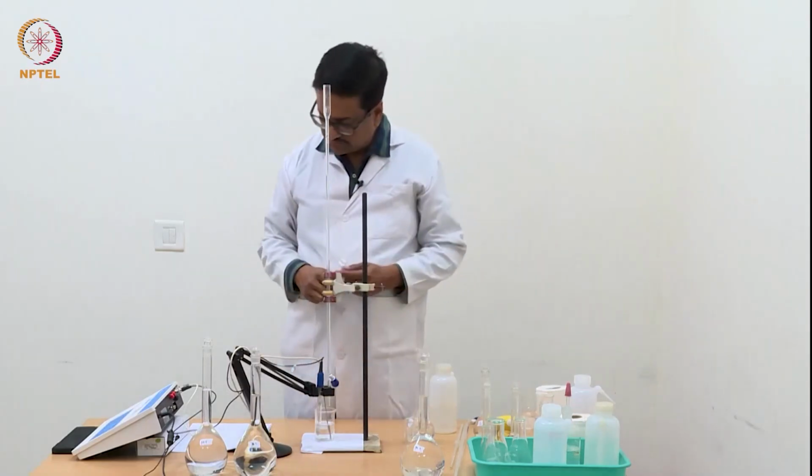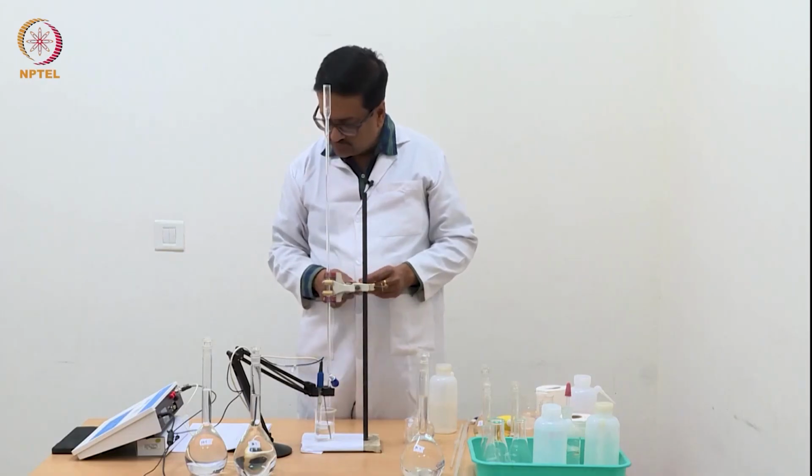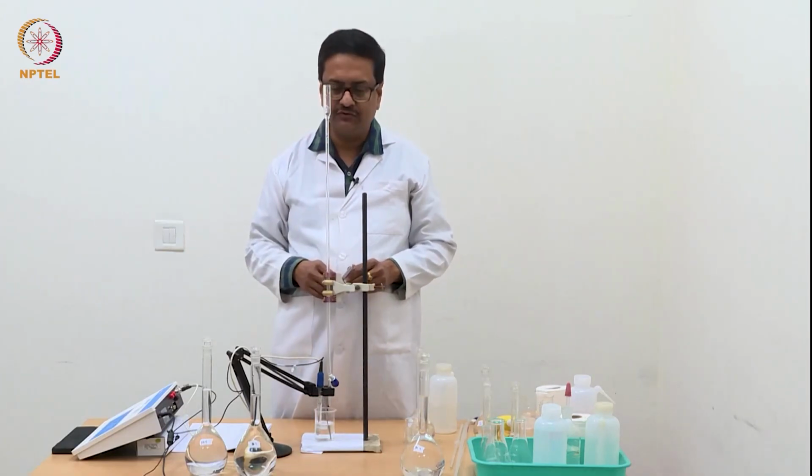So now we have just crossed the pH value of 7 at about 1.38 ml. Now the pH is reading 7.25.